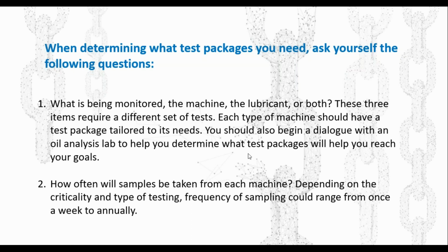We want to talk about what is being monitored. Are we looking at the machine? Are we looking at the lubricants? Are we looking at both? Depending on what your goals are, each type of goal is going to require a slightly different test package to achieve it. If you want overall health, that is going to be a little different than specifically looking at the health of your machine. So we need to determine our test package to help us start extending that oil life, so we can look at the things we actually need to look at.